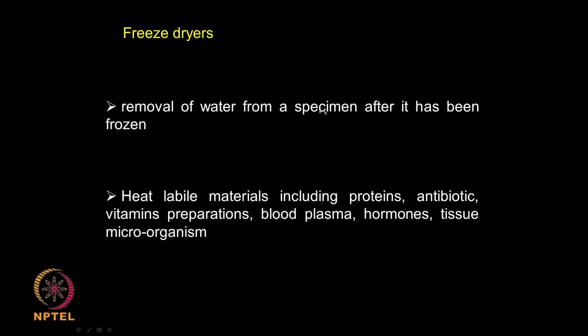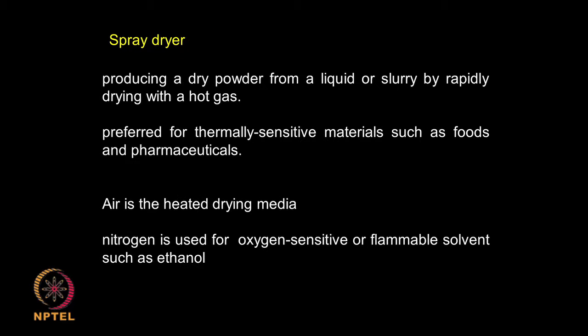So, removal of water from a specimen after it has been frozen. It is very good for heat labile materials including proteins, antibiotics, vitamins, blood plasma, hormones, tissue, microorganisms, and so on. Then you have the spray dryers, like your coffee powder or instant milk powder and so on.